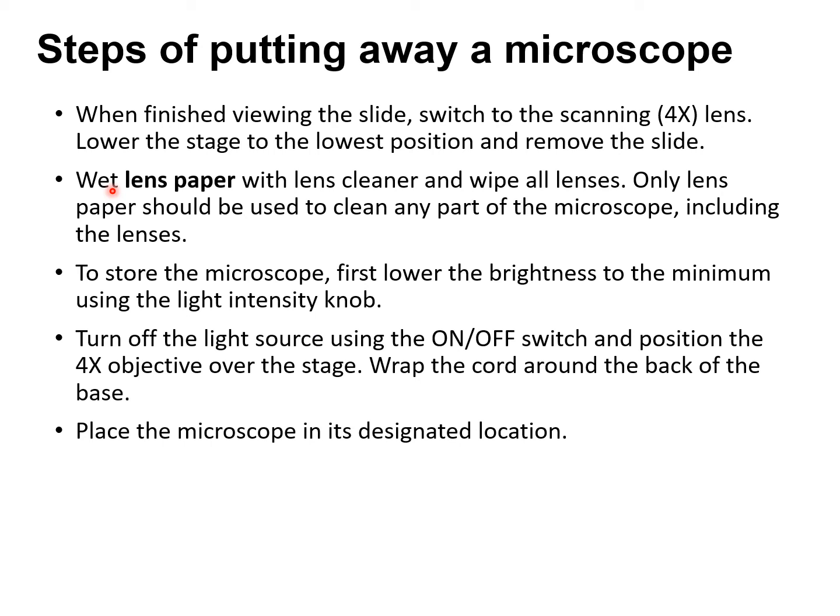Now, when you're done viewing your slide, switch to the 4x lens, lower your stage to the lowest position, and remove your slide. Don't forget your slide on the stage. Make sure that you remove the slide. Wet a lens paper with some lens cleaner and wipe your lenses. But by the way, never use the same lens paper to clean all of your lenses.